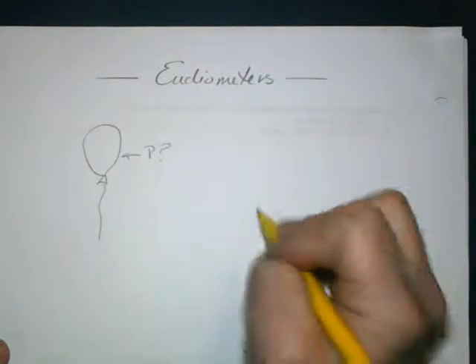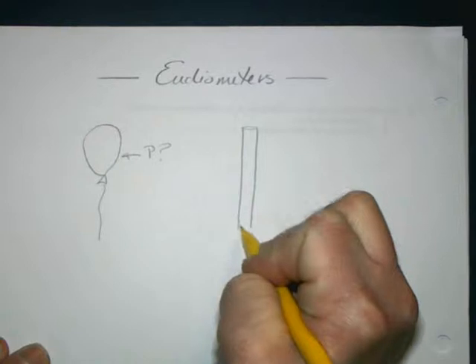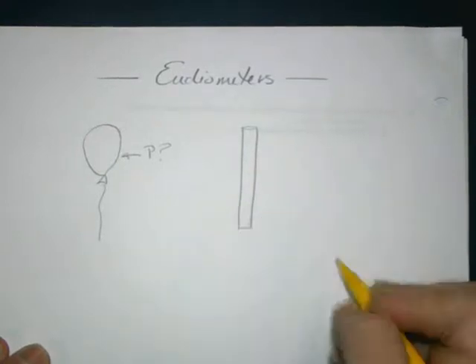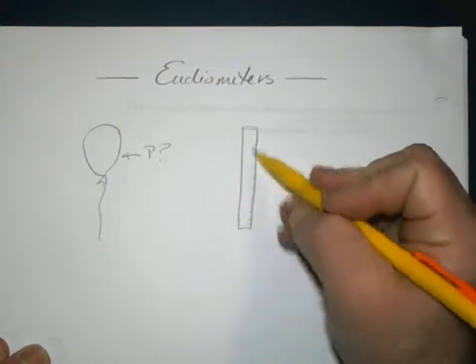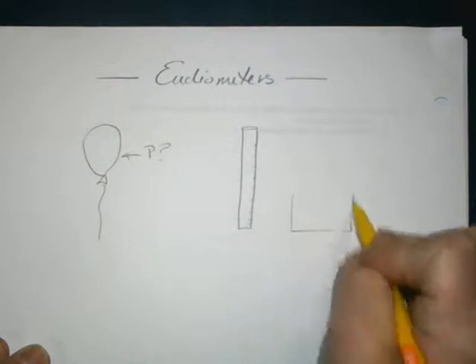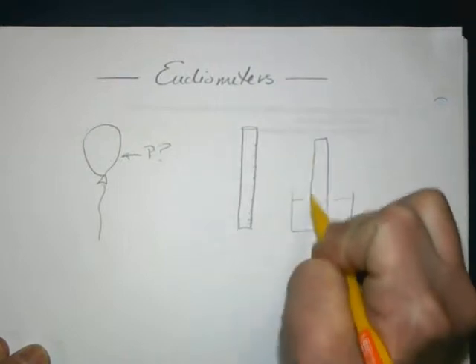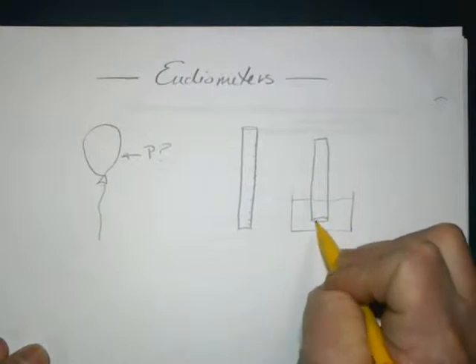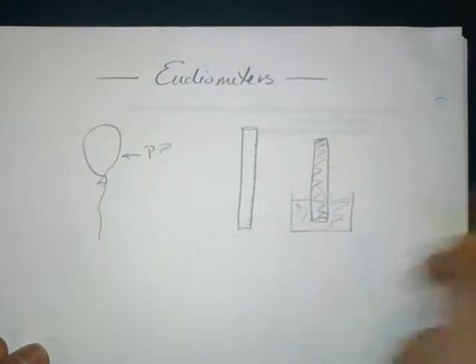In lab, they are long test tubes that look a lot like our burettes. They have graduations on them, and they're open at one end. Usually, we are filling these with water, completely overturning them, putting them beneath the surface of a beaker of water, and then allowing the opening to be released, and this will be filled completely with water then.